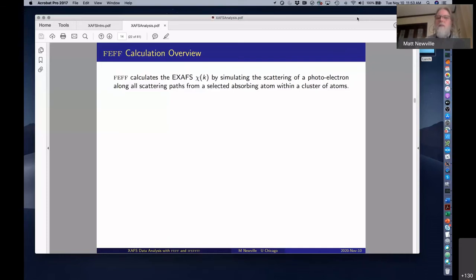But there are cases, especially for softer materials, so metals, and things at high temperature, where that third cumulant can be important. It can be important if you're really focused on what the distance is, or what the changes in distance are as a function of, say, temperature. So if you're ramping up temperature, you need to take into account that third cumulant, or at least include it in the model.